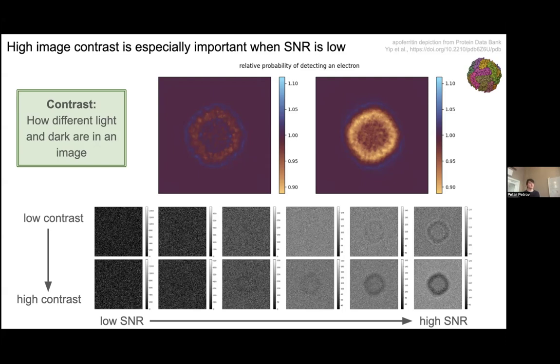What's a typical sample look like? Like, is it a cell or some biological matter? Yeah, that's a good question. So we're kind of glossing over that in this presentation, but it's basically found that because of these products that form and the mobility of the ionized products that do chemistry, freezing the sample, so plunge freezing it into a solution of liquid ethane, will vitrify the water that the sample lives in.